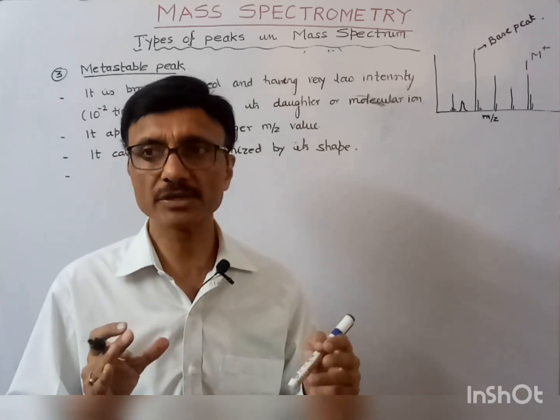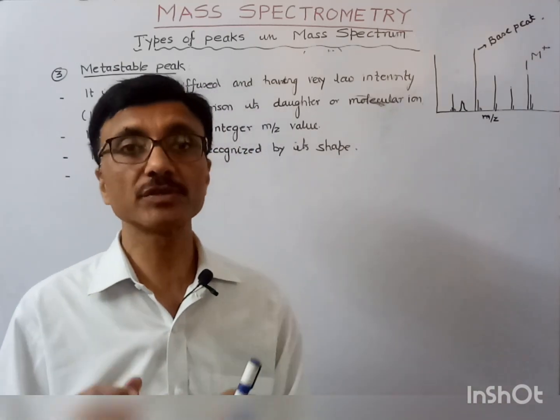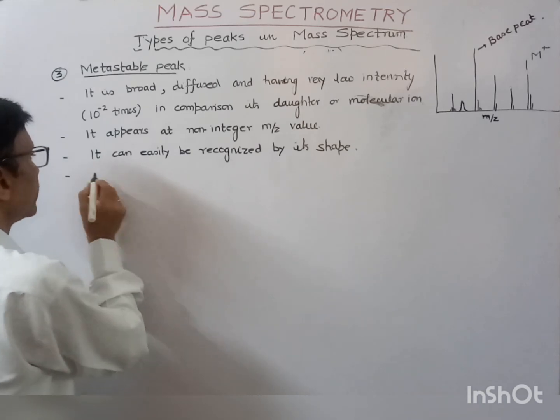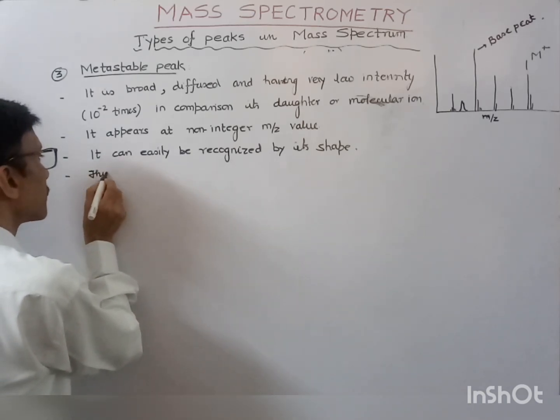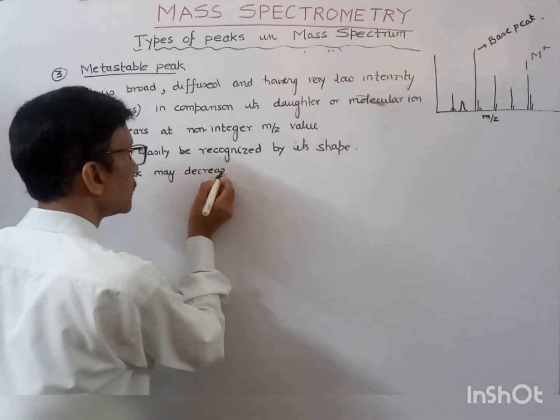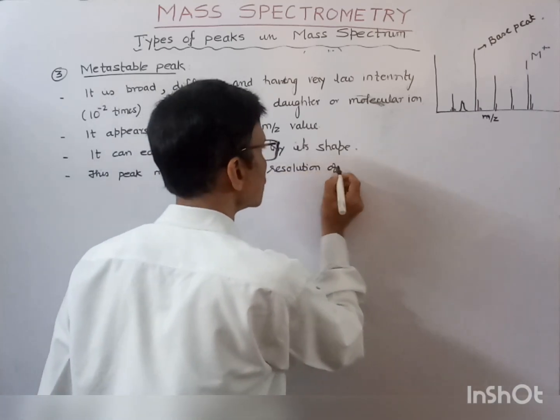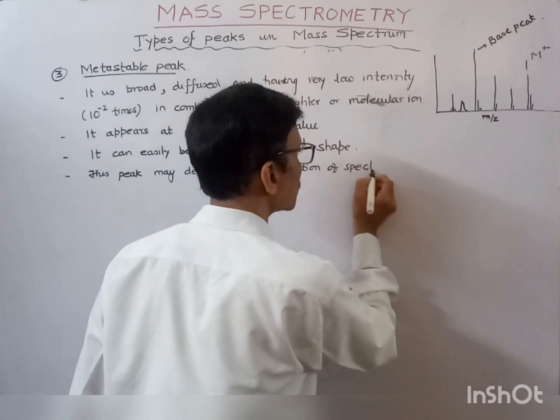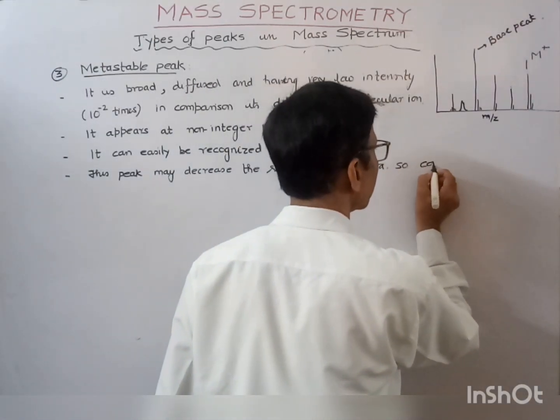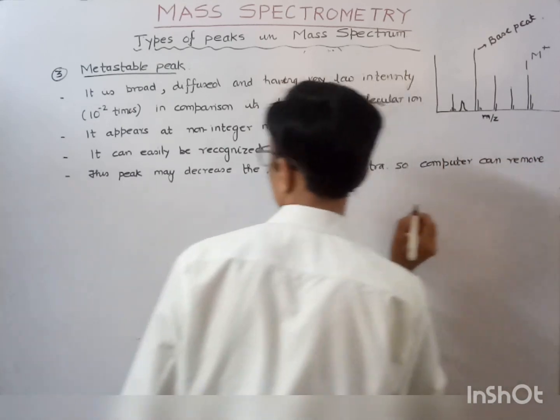In the presence of this peak, the resolution decreases. So this peak may decrease the resolution of the spectrum, and that's why sometimes the computer also removes this peak.